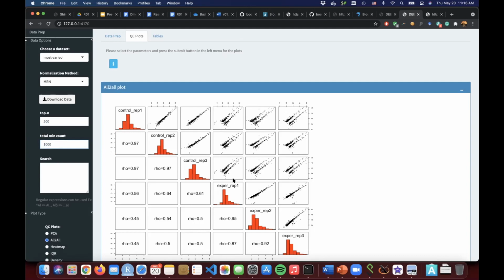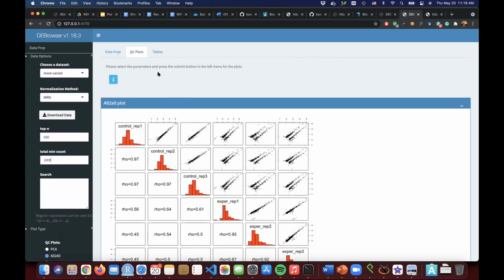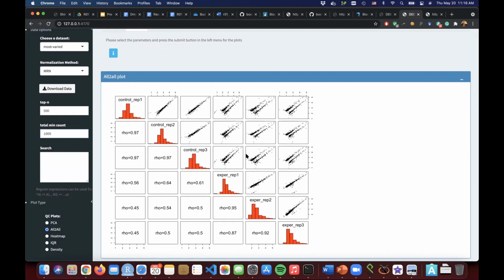It's already showing me some differentially expressed genes without doing differential expression analysis. So if your data is like this, you are lucky. And this data is from Vernier et al., done here at UMass, and they did a beautiful and clean job, so that without doing any DE, you can actually see the separation.